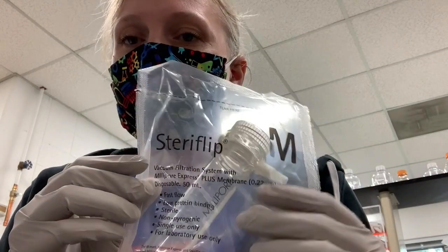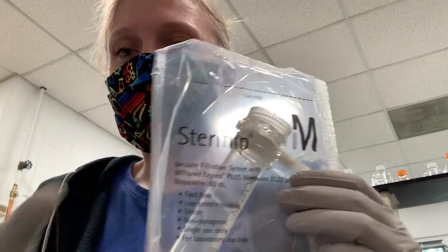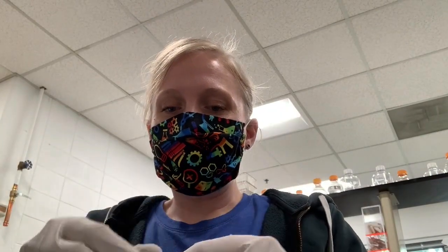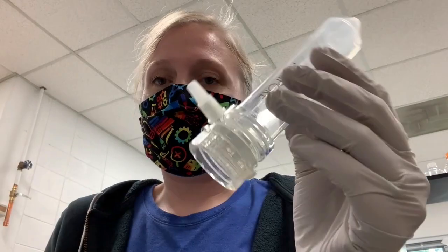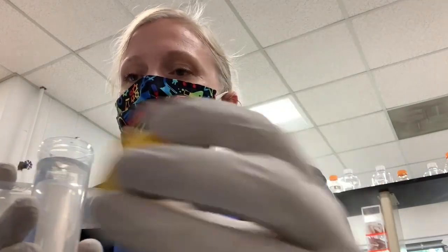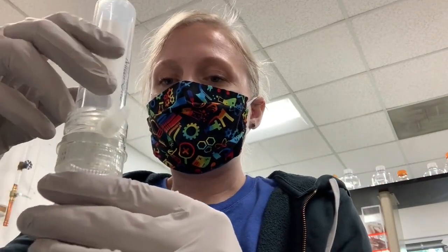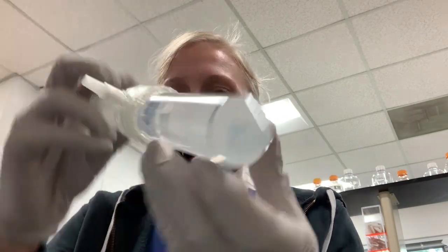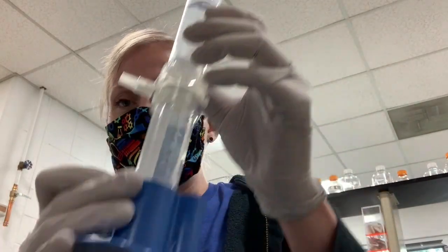So I use this Steri-Flip, which is really good for when you have just one conical tube's worth of a solution. You can tear this open, being careful not to touch the filter with your hands. And this just has a tube with a filter on the top and then a little outlet for the vacuum. I'm going to take the lid off of this 5 molar ammonium acetate tube and just throw it in the trash and screw this Steri-Flip system on top of that tube. I'm then going to invert this tube and stick it in a rack.